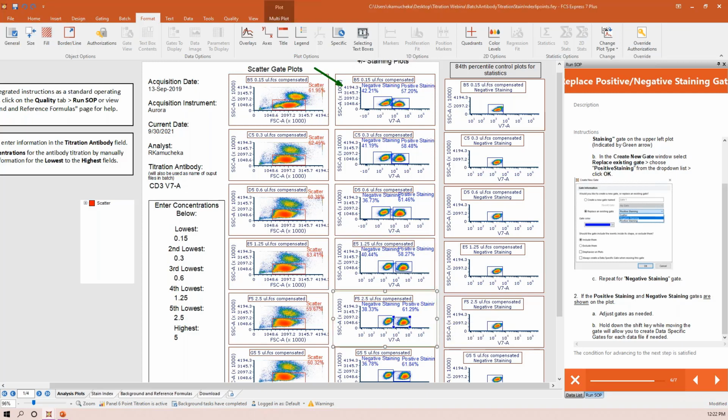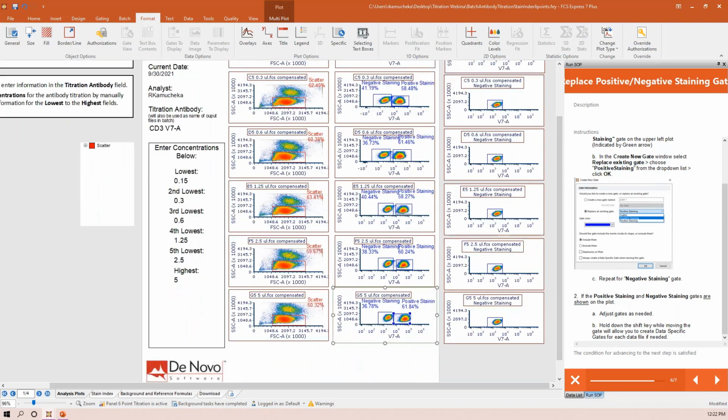And so that's another thing that I want to bring up. If you find yourself doing something that maybe you wanted to take back, that undo button is your best friend. Just click it, it will undo the thing that you did and bring you back to where you were before you made the change.